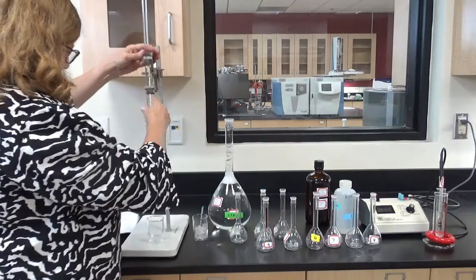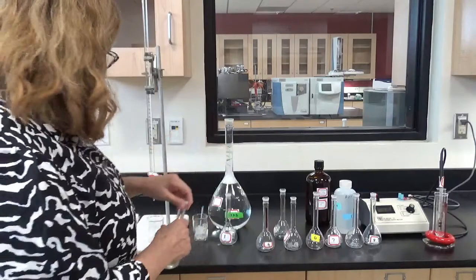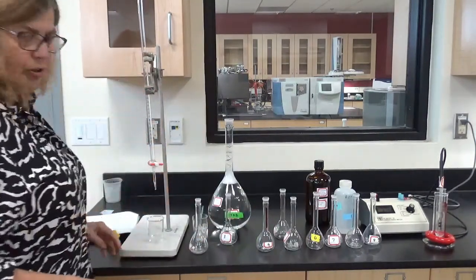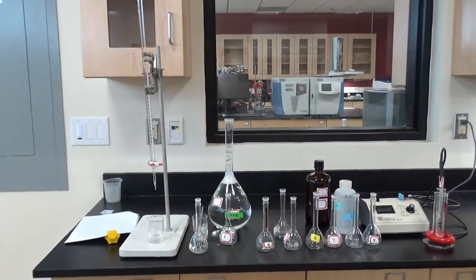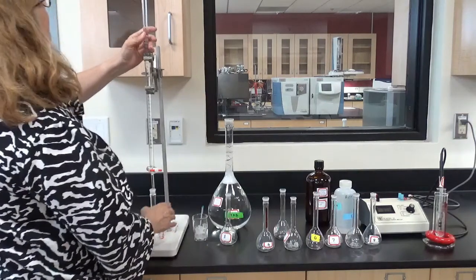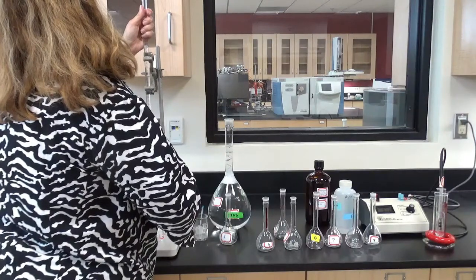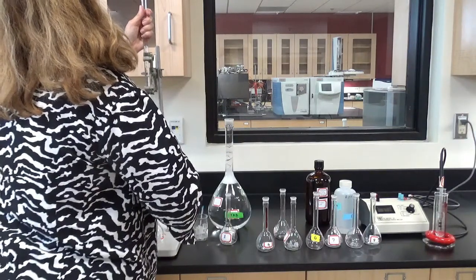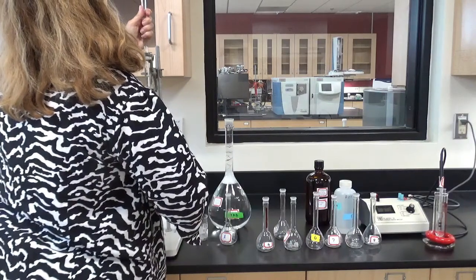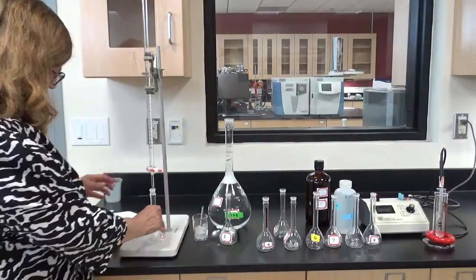So if I'm going to add 5 to solution 2, I'm going to go from 2.00 to 7.00. That's what I'm aiming for. There's 7.00, so I got that.